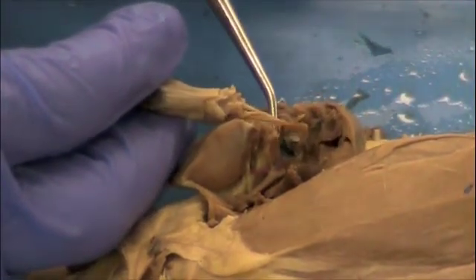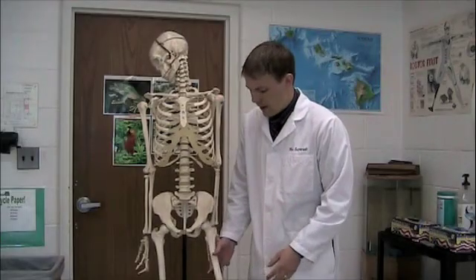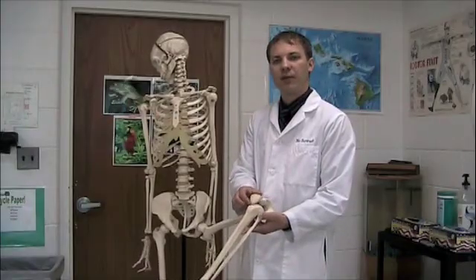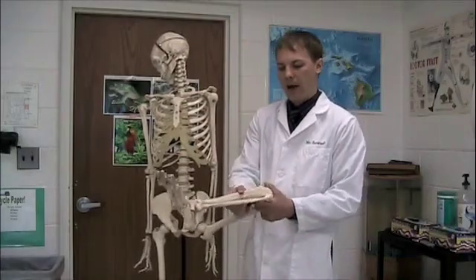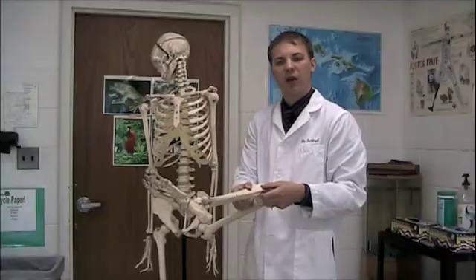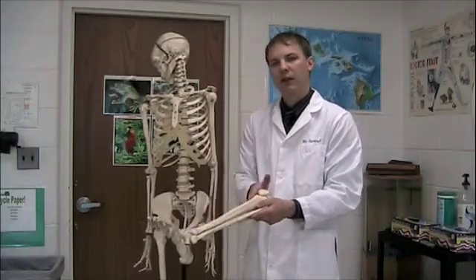Now we'll take the human skeleton and look at these same bones. The leg bones are a little bit different between the rat and the human, primarily because of the method of movement — rats on all fours versus humans walking upright. The femur extends from the hip down to the knee and is the largest bone in the human body. There is a small bone here called the kneecap, also known as the patella. Then two bones extend from the knee to the ankle: the tibia, which is the larger of the two, and the fibula, which is the smaller, skinny bone with a slight space between them.